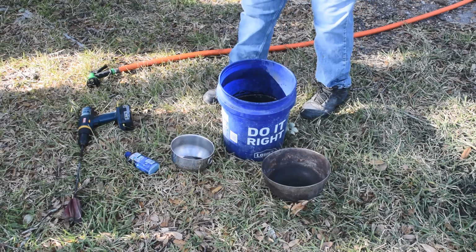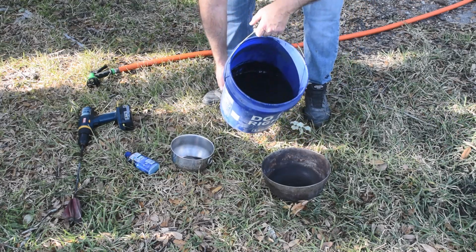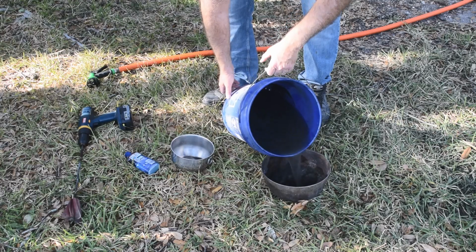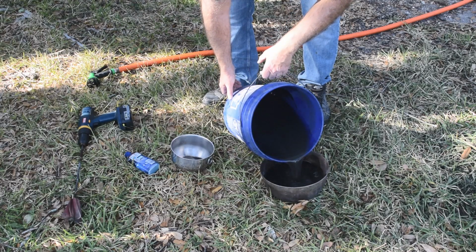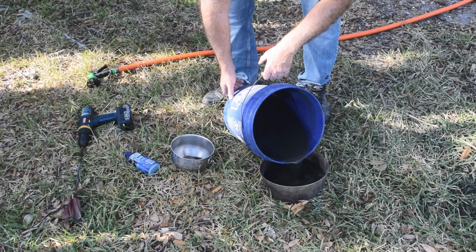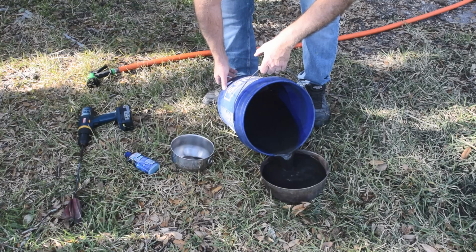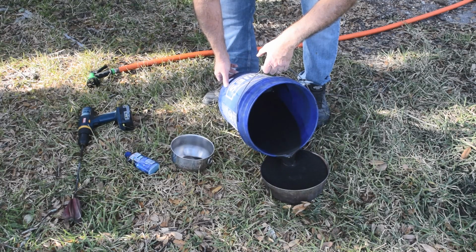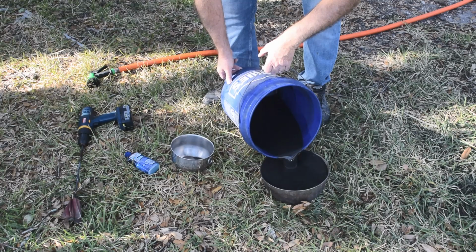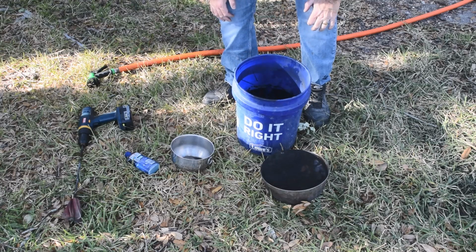All right, it's been 5 minutes. So let me gently pour this stuff off. Oh, wow, look how clear the liquid is. Maybe I didn't need to wait a full 5 minutes, because it looks like a lot of the black stuff has settled out. So I'm pouring this into another tub here. This other tub will catch any solids that come over that I don't really want to lose.